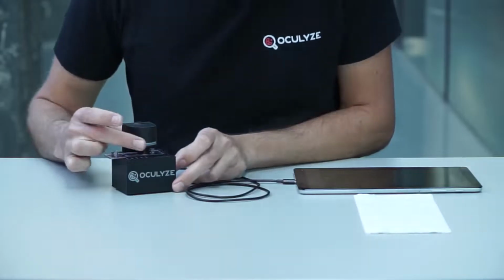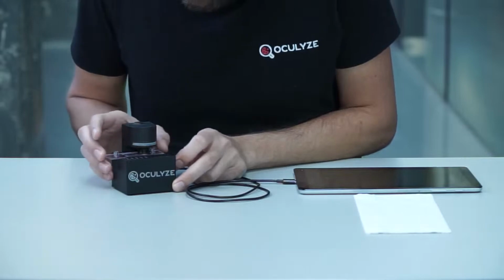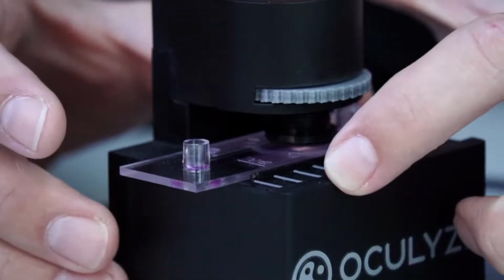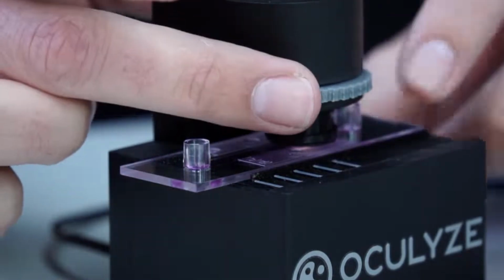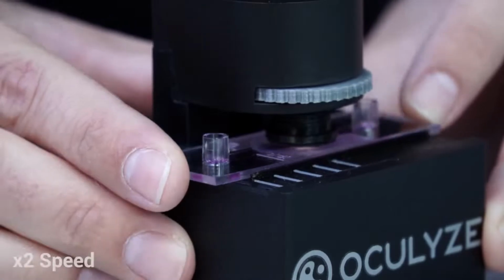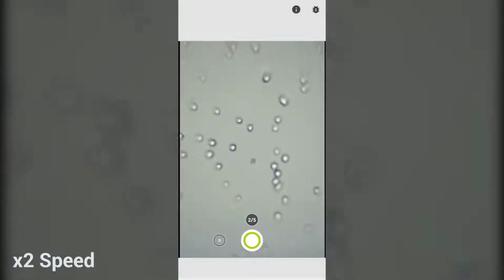Step 7. You must conduct this step 5 times. Turn the focusing wheel clockwise to release the chamber before moving into the next marking. Click Keep if you are happy with the image, each time moving the position of the chamber to the respective marking.